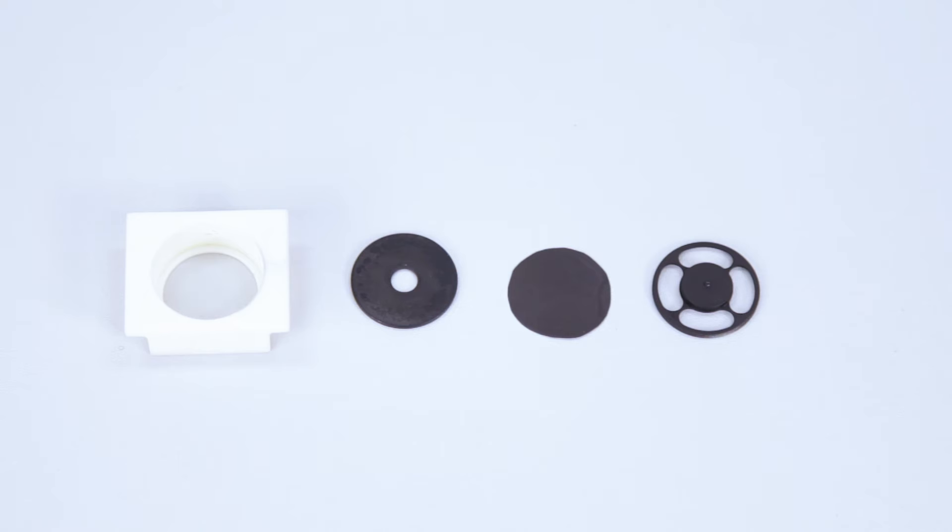Here is the in-plane fixture that we use. You need a very thin sample with one inch diameter.